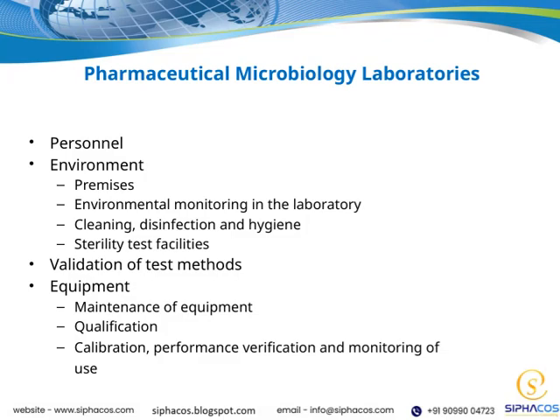Let's start by talking about personnel, environment, and premises. These are the foundation of a reliable pharmaceutical microbiology laboratory. Having well-trained staff, a controlled environment, and properly maintained premises are essential for ensuring accurate and consistent results.